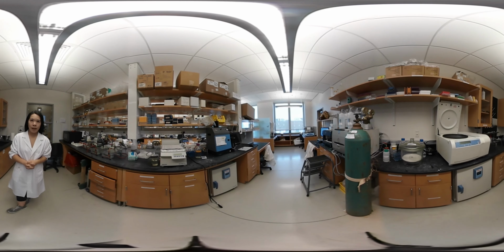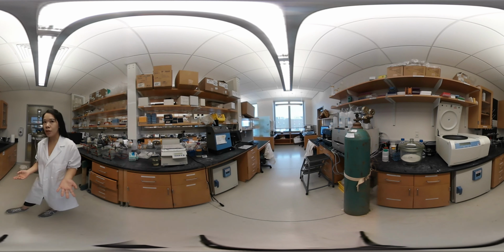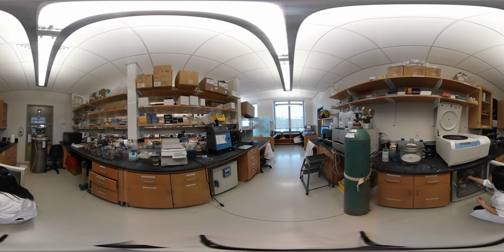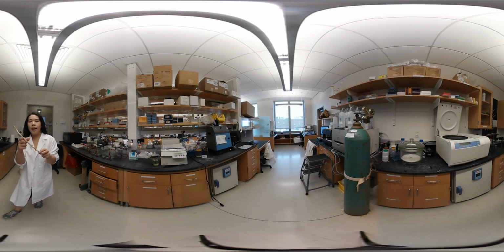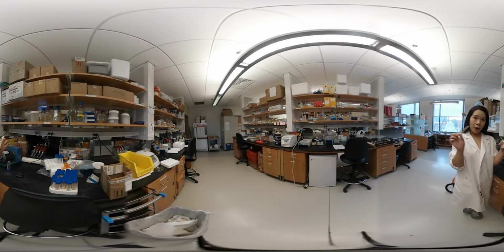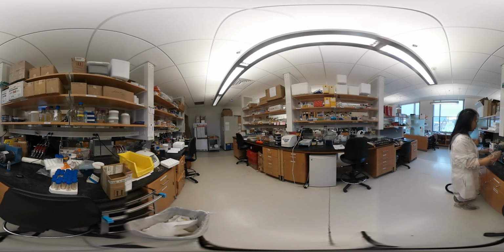After collecting samples in the greenhouse, we send them into the oven at 100 degrees to dry them. So the sample is like this. You can see it's like a normal stick. And this stem tissue is from the transgenic plants. Now we're breaking down the whole stick into small pieces, and then we're going to grind them into powder.